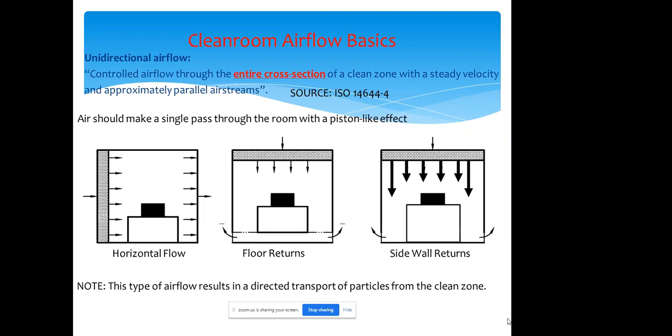So if you are doing an experiment while we are looking at this slide, I may be getting ahead of myself here, but if you are doing an experiment and you know your HEPA filters are right there above you, you either have to sit down and allow the air to pass through your process. If you hunch over, then the air is going to hit your back or the top of your head, and therefore air around your process is going to start circulating, going around in circles, turbulence, and therefore you end up with a contaminated product.